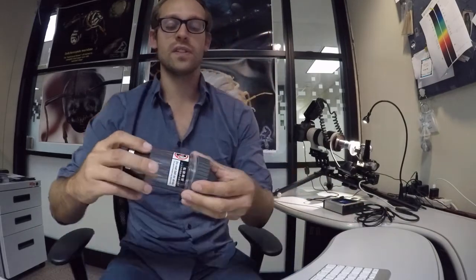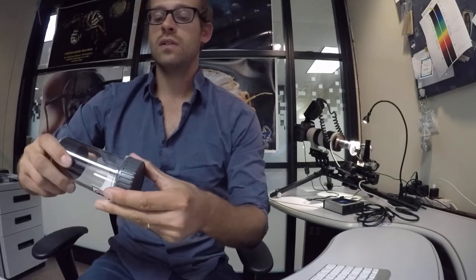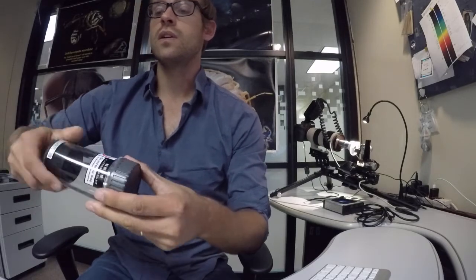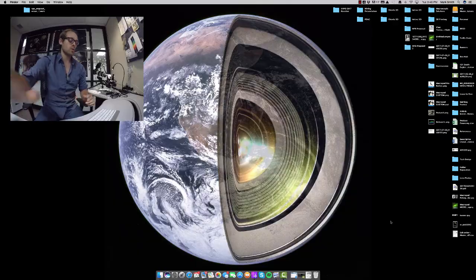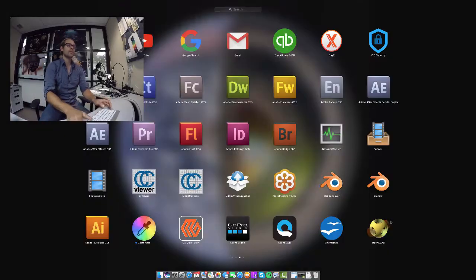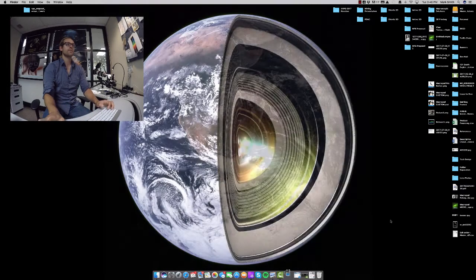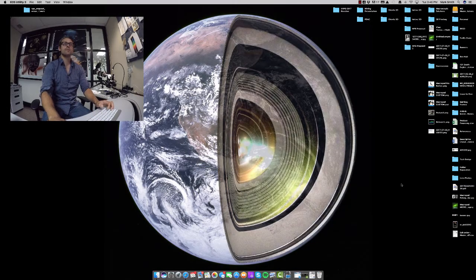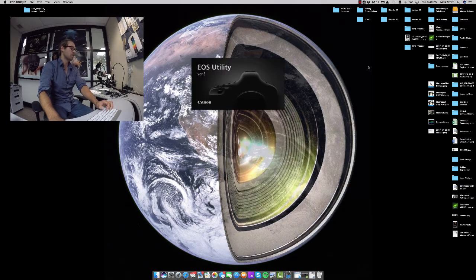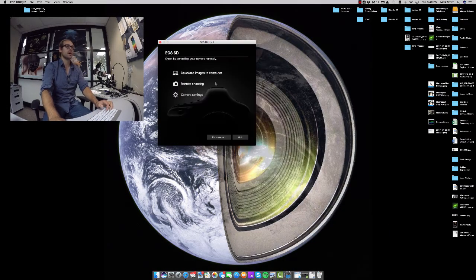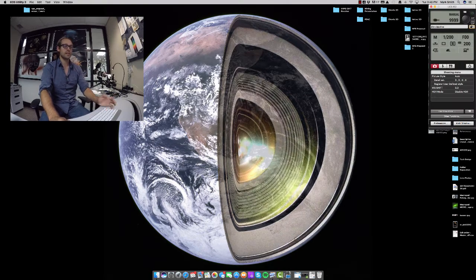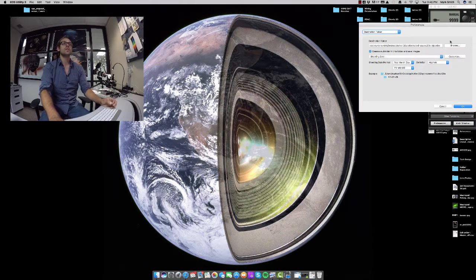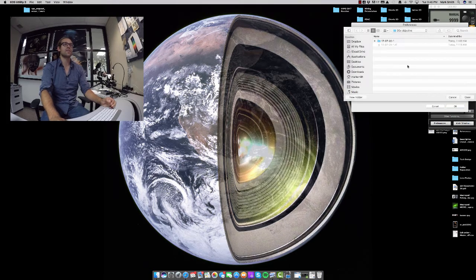I'm going to put this off to the side. Then I'm going to open up my EOS utility. We're going to create a third folder, which is going to be our 50x objective.